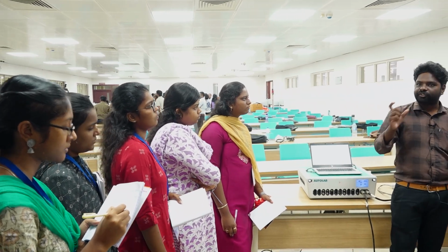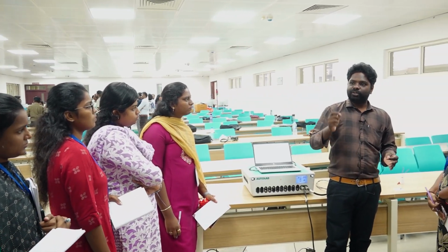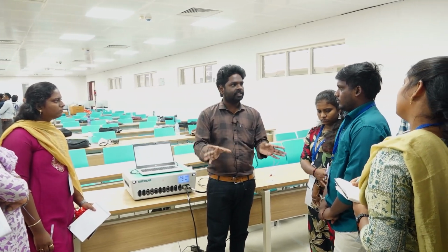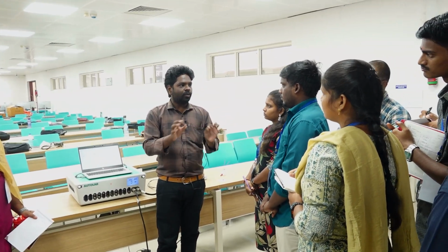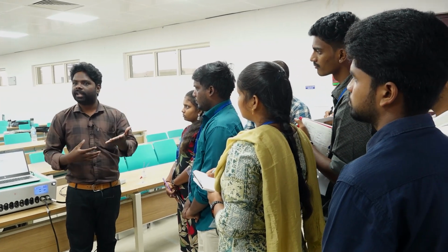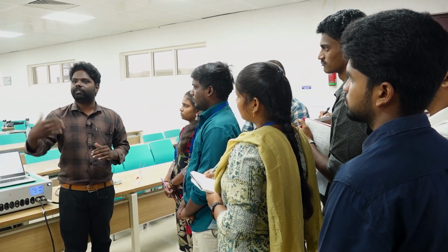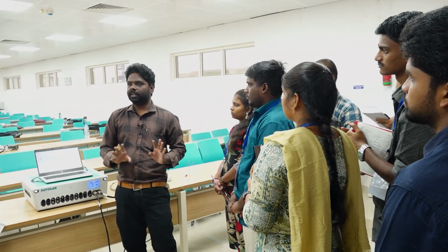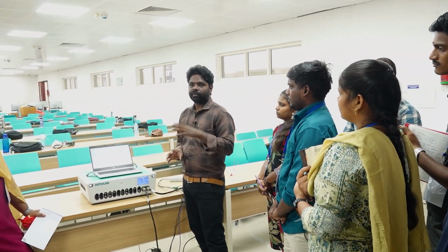This is the advantage of EIS. So this is an important technique, a non-destructive method. Generally, corrosion people first do the EIS, because once they polarize, the material will be disturbed. So without disturbing the material, EIS is one of the best techniques to analyze the properties of our sample.